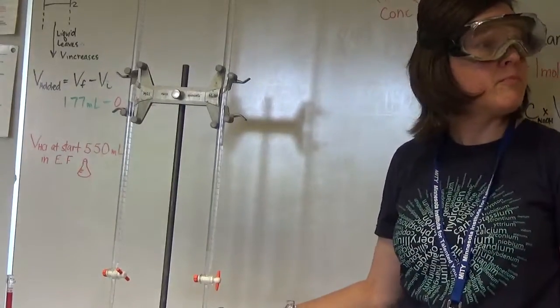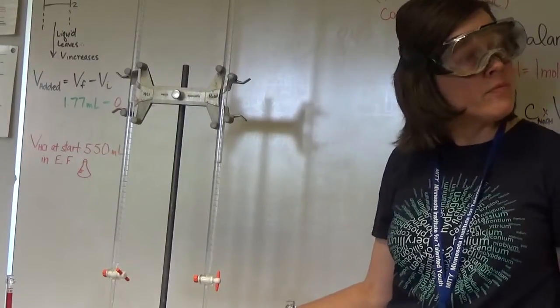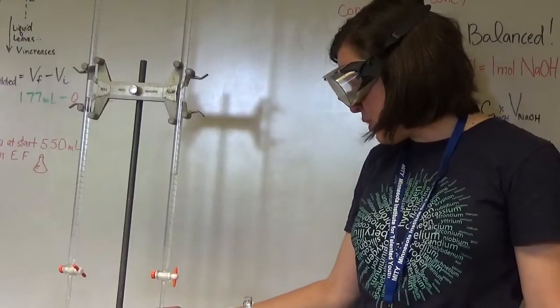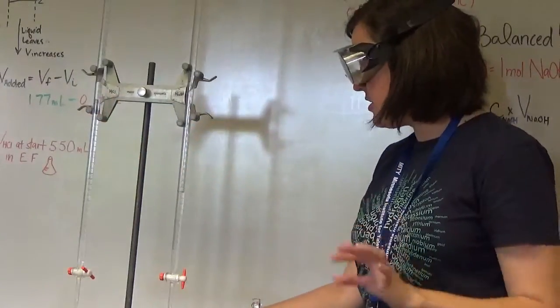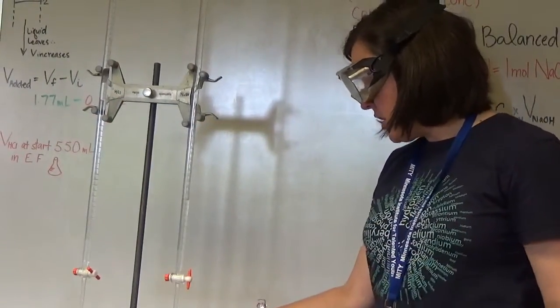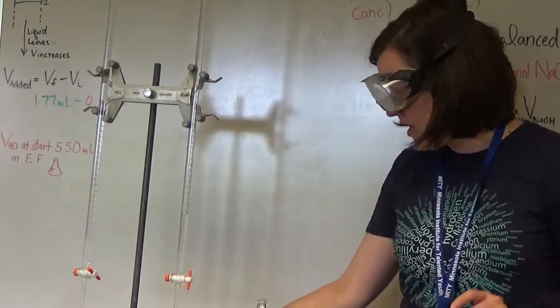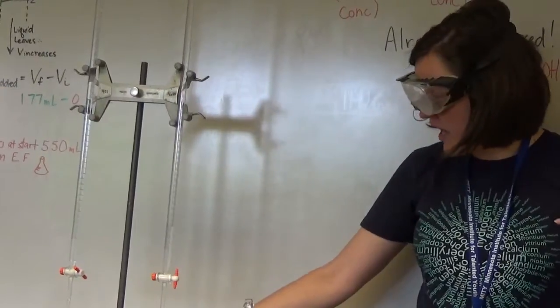Good, Siri. What is the goal of this experiment? We are looking for the concentration of HCl. Good question. There's lots of directions in your direction book. You will not do the step where you're going to HCl. We're just going to do the one with NaOH. We are going to look at the very end of the experiment to see who's got the lightest pink. So when you've got a really faint pink, you can call Mara and I over.